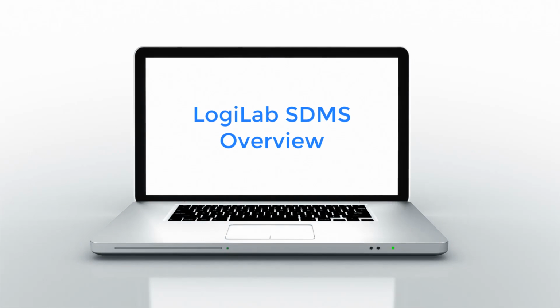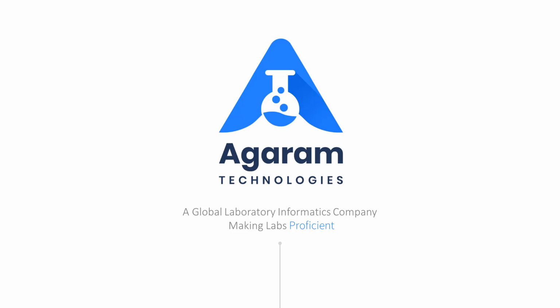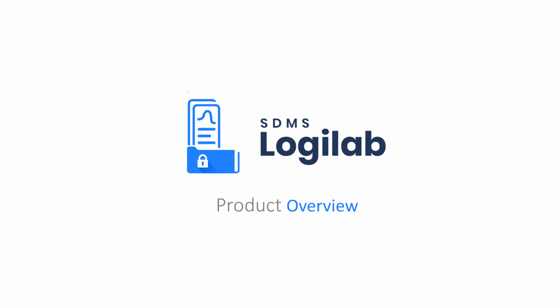Good morning, everybody. Today you are going to see a video on LogiLab SDMS overview. This video is about LogiLab SDMS product overview. You will be able to see the core functionalities of LogiLab Scientific Data Management System.